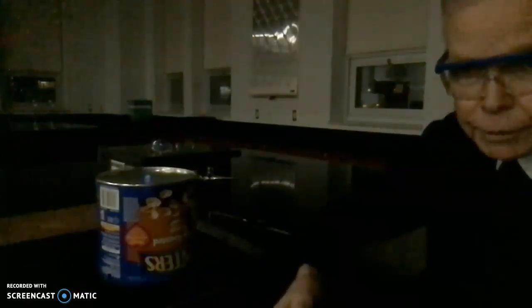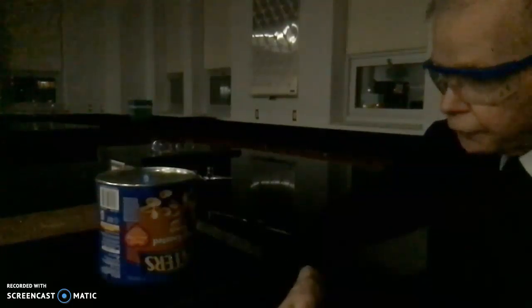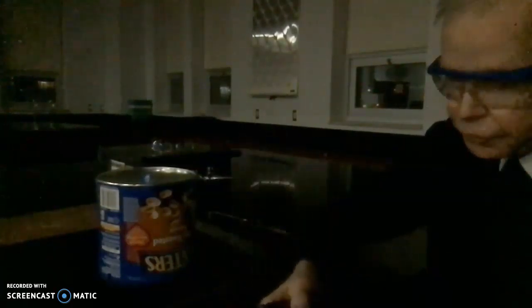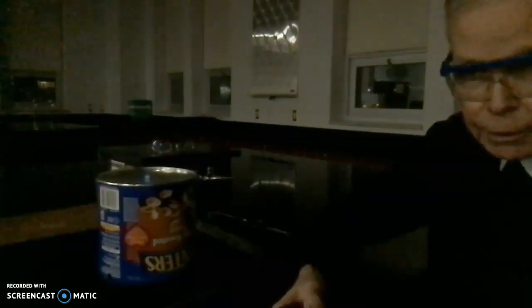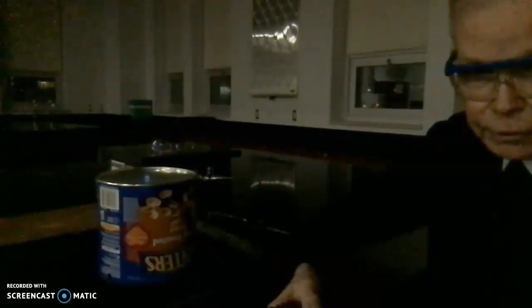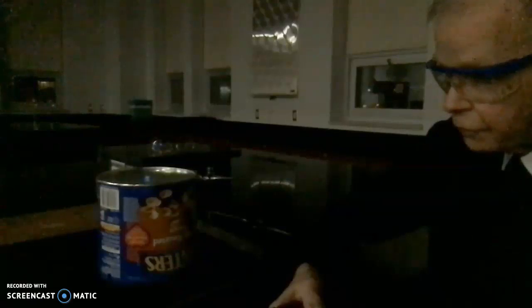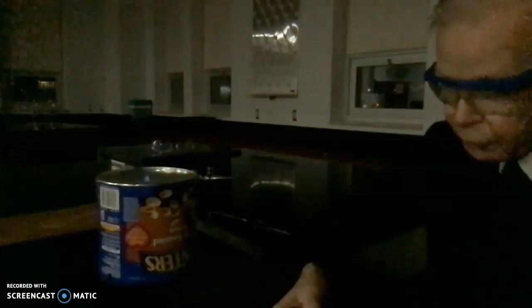I've moved the computer camera a little closer to the can, and you can see the flame has diminished a good bit. Checking my stopwatch here, I know that we're getting pretty close to the point where our combustion will be complete. Fortunately, this evening, the air system isn't as pronounced, so there aren't very many drafts in the room, which could possibly extinguish the little flame sitting on top there. So we have a little bit more time left.